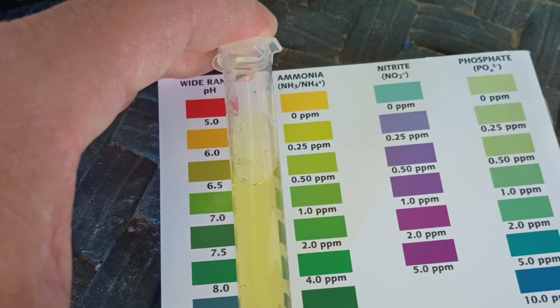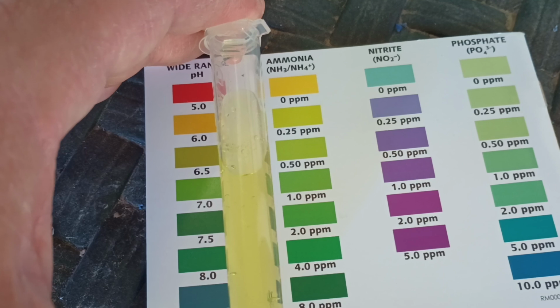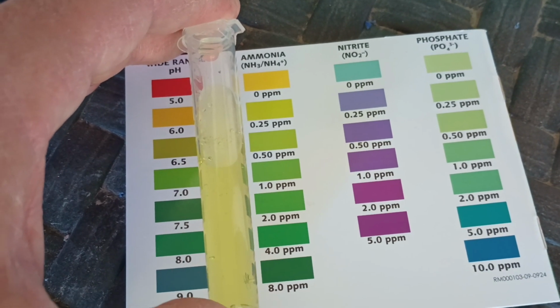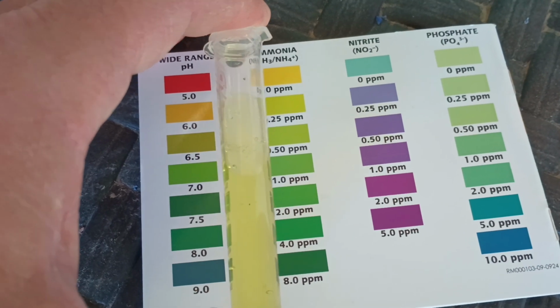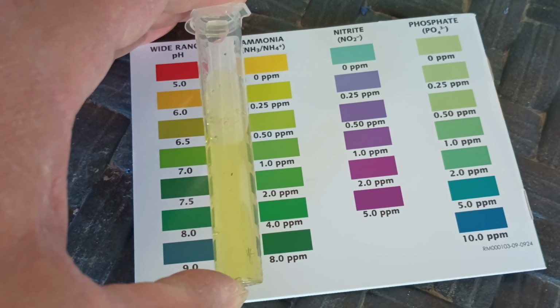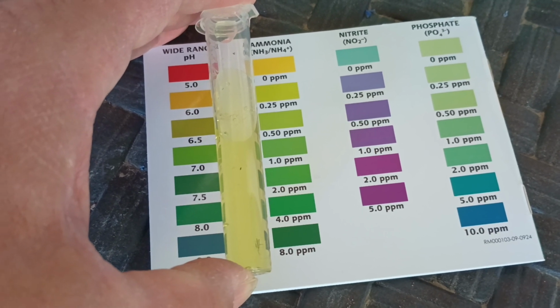Here's what it looks like. So I'd say that's 0 parts per million of ammonia. So the ammonia looks good. I'm definitely high on the pH. I'm 9.0 on the pH. I'll test that next. Let you see that. But the ammonia looks good.